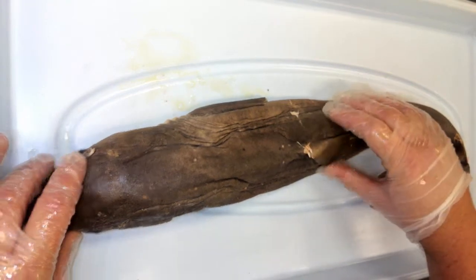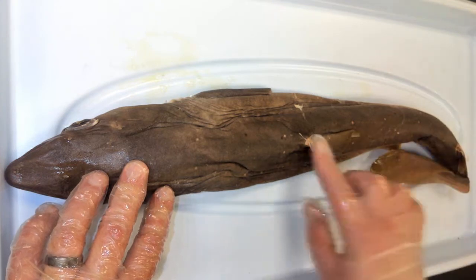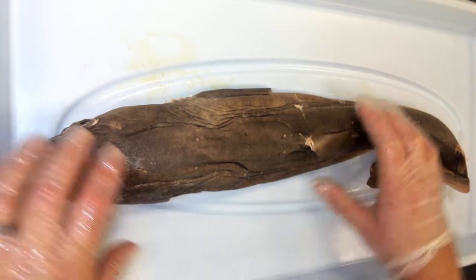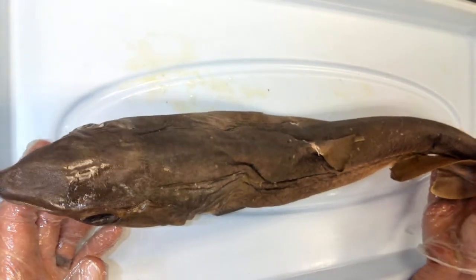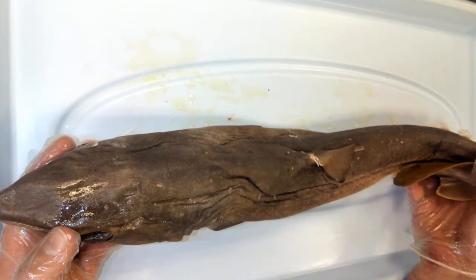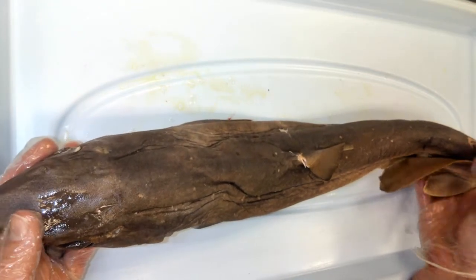The name Squalus acanthias means it's a spiny dogfish shark, because it has venomous spines on the dorsal side — on top of its body. I'll talk more about those later. These sharks don't really grow more than about three feet long.